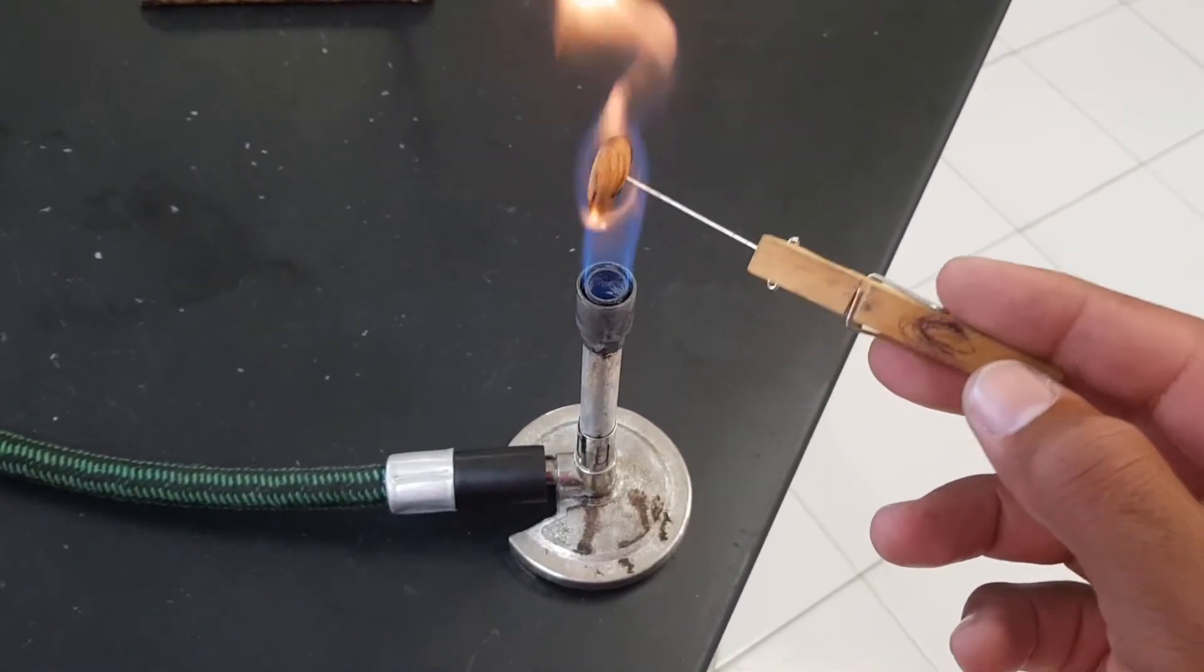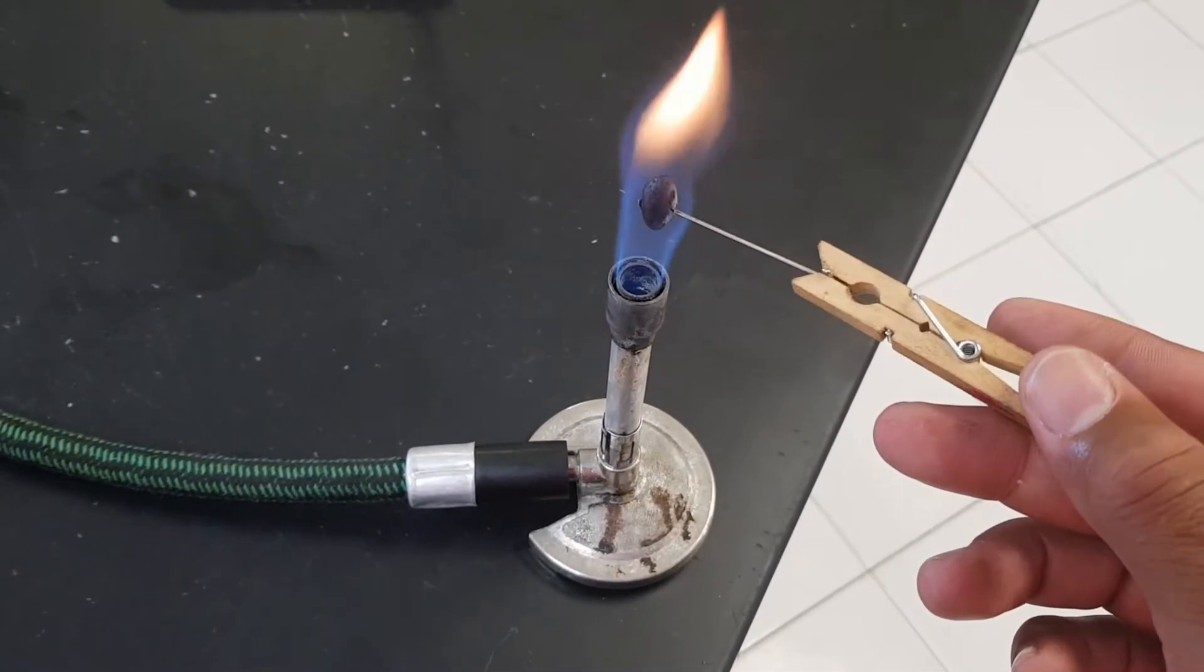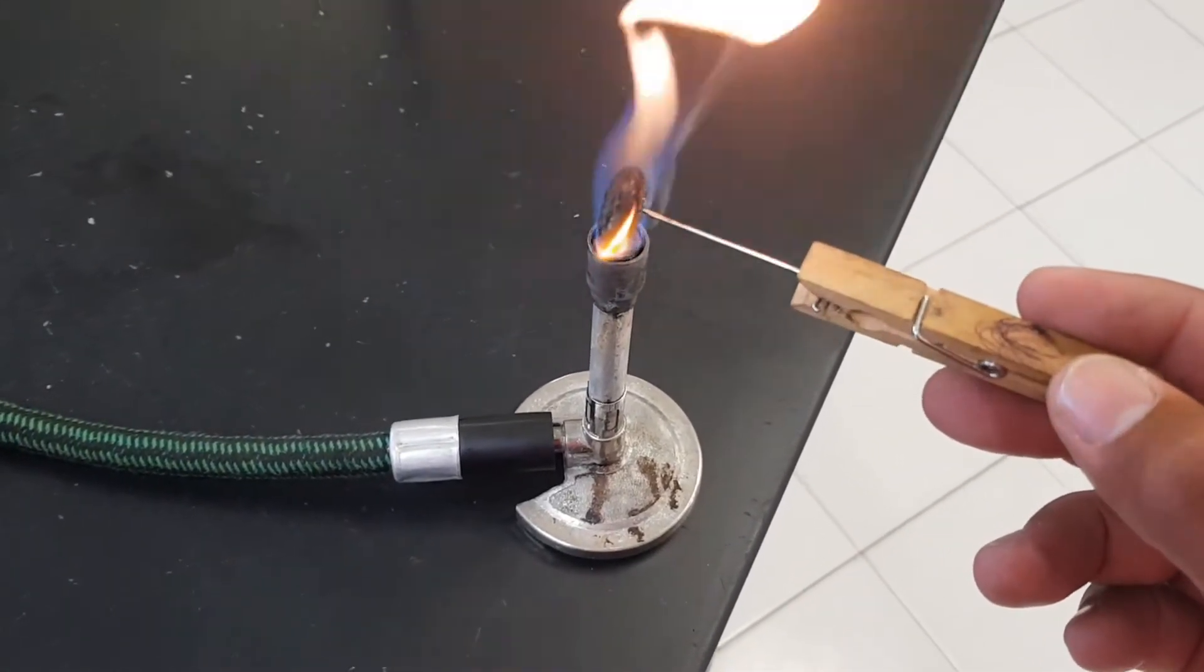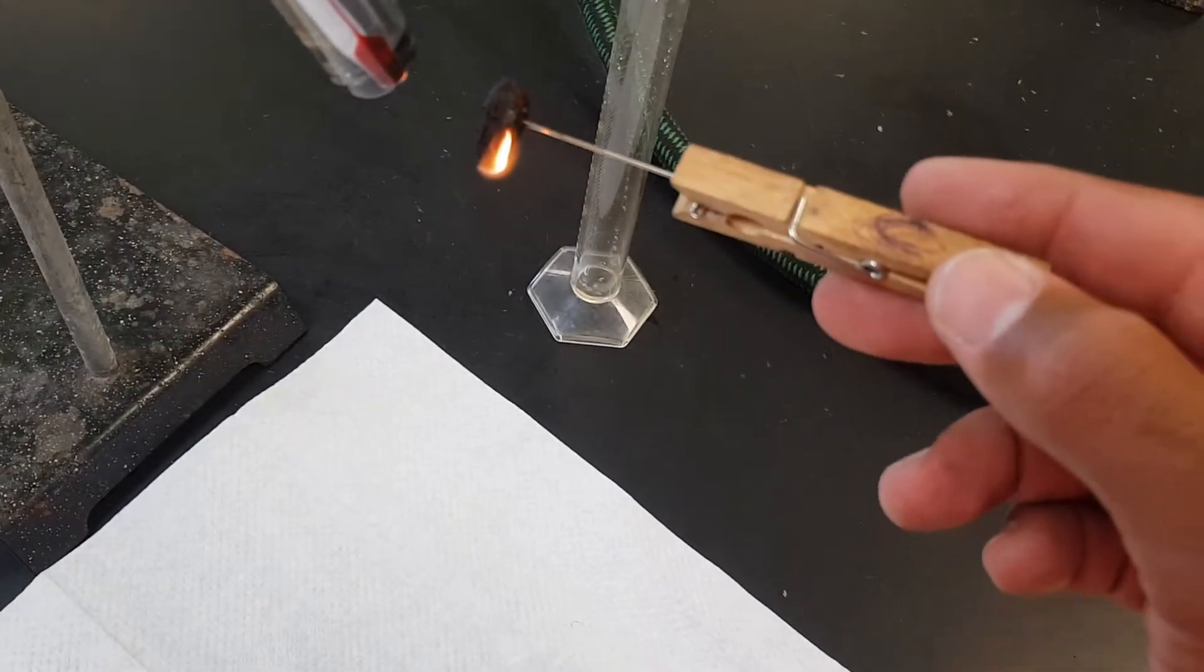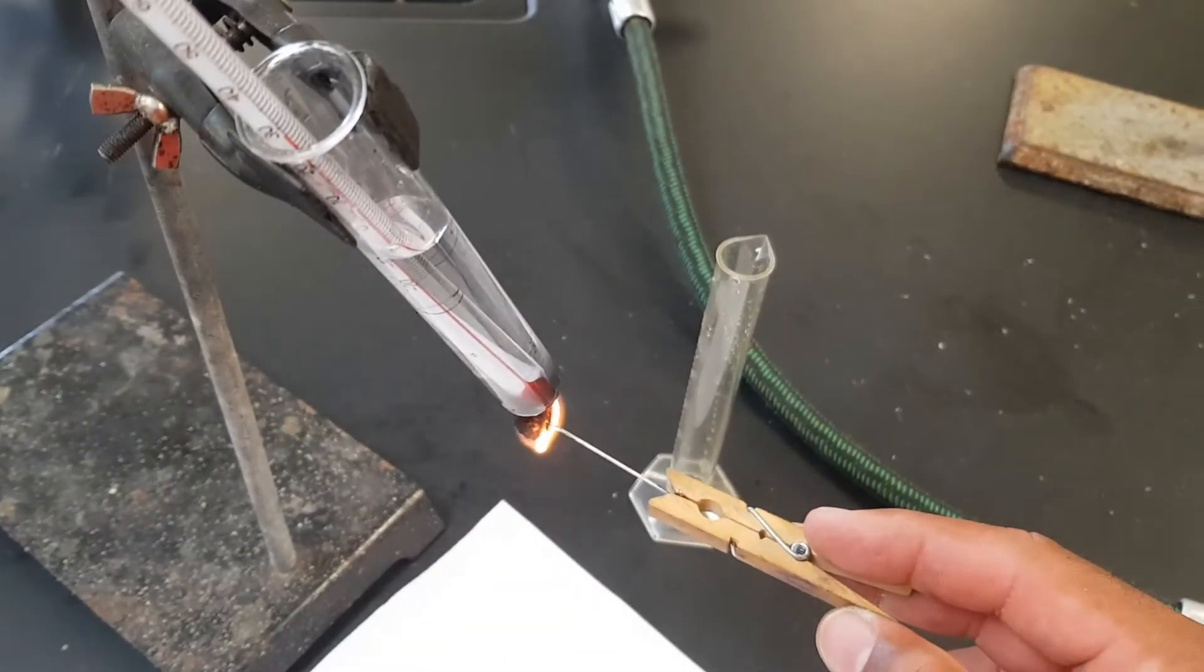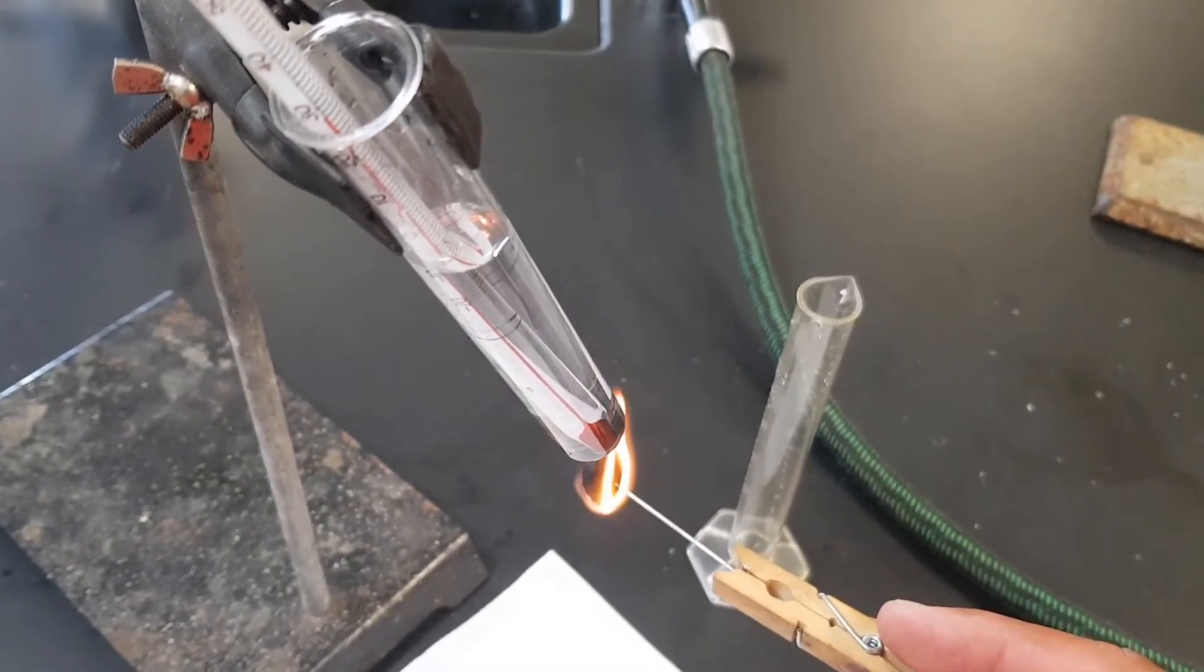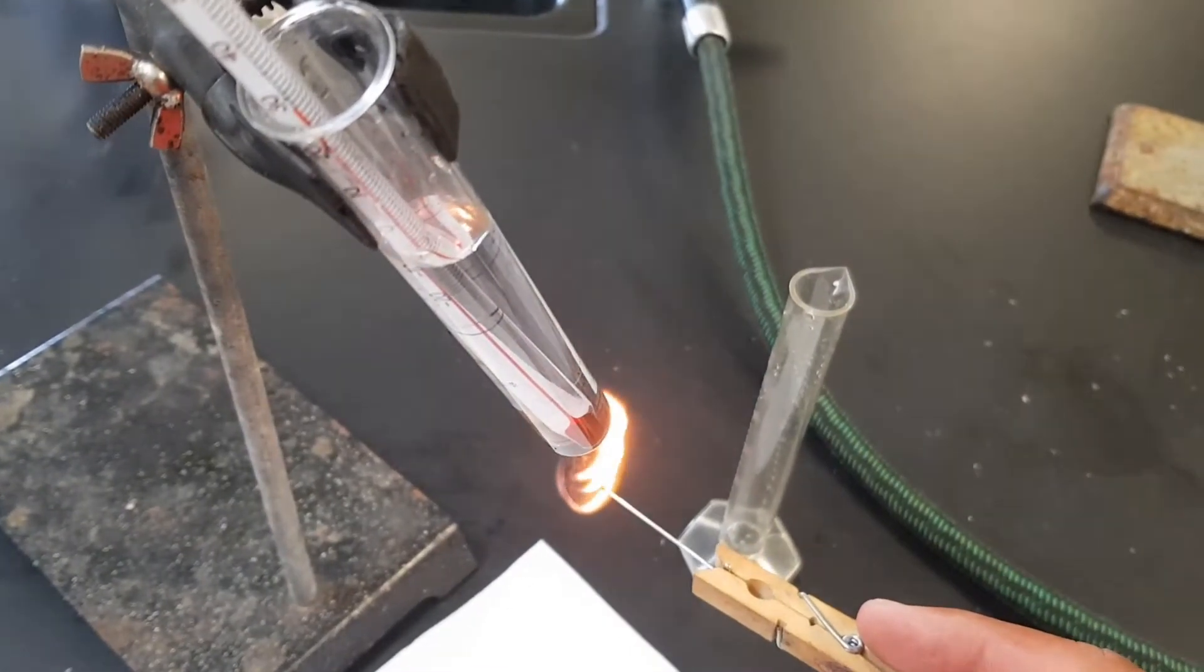So once the nut catches fire, you can put it under your test tube. You want to make sure you maintain the distance of the nut on your test tube. You're going to burn this nut until it is fully burnt out.